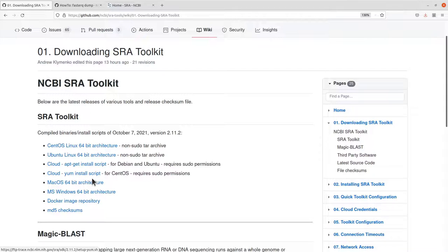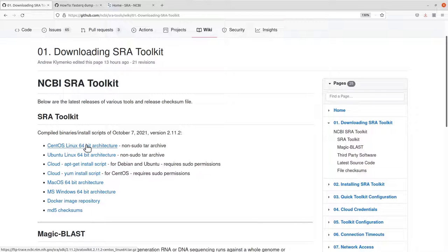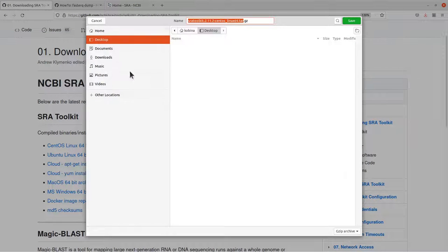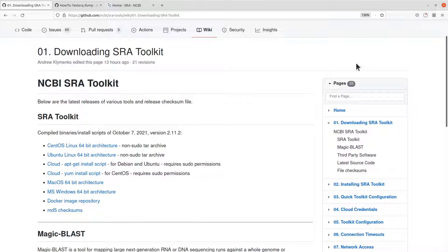I'm using CentOS, so what I'll do is download the binary here. You can use the browser by clicking on the file to download, or you can use the command line — I'll show you both. Now let's use the browser: click this file here, download it, and save it. I'm saving it on my desktop. This is how we do the download for the SRA Toolkit binary.